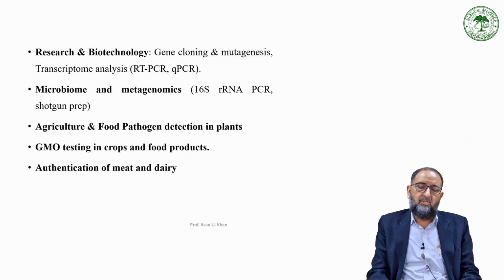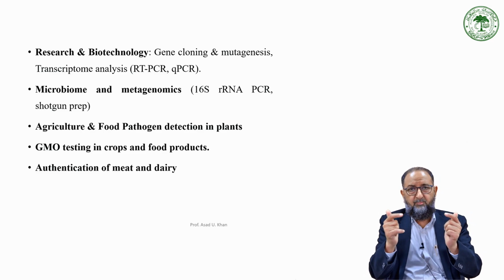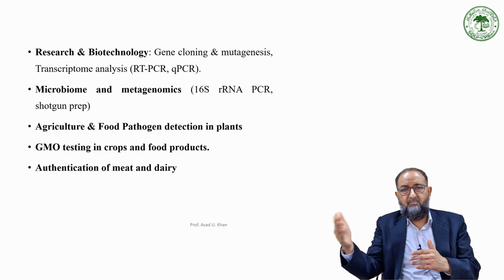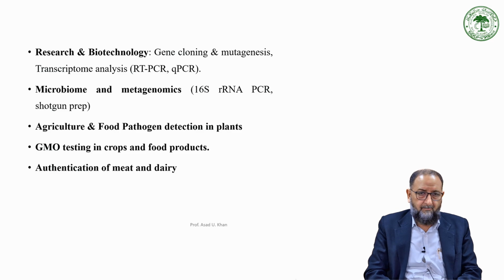Reactions and very important experiments which are used in the research of biotechnology. Site-directed mutagenesis: without PCR you can't do it. You must have primers with slight mutations in the templates, so the product will be amplified with that mutation, and that mutant product is cloned into the vector to give you the site-specific mutation.